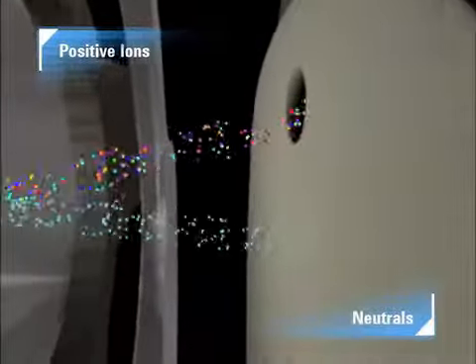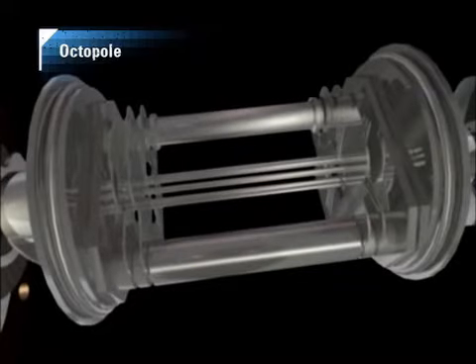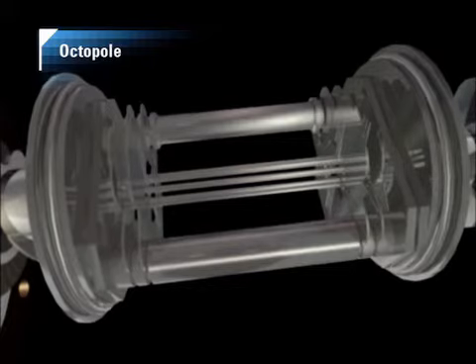Electrostatic lenses focus the ion beam and separate the positive ions from the unwanted neutral species by bending them into the reaction cell, the heart of the octopole reaction system, or ORS. The ORS is unique in using an octopole ion guide in the cell rather than the hexapoles and quadrupoles used in other cell ICP MS systems.